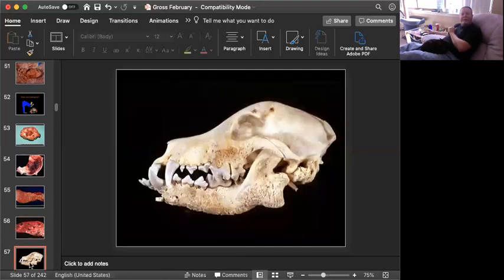Slide number 5 is tissue from a dog. Smee, you don't like all these dog slides. You want a cat slide, but sorry, you got to take what comes. Hey, can you give me a morphologic diagnosis and name the condition? Also name a breed.